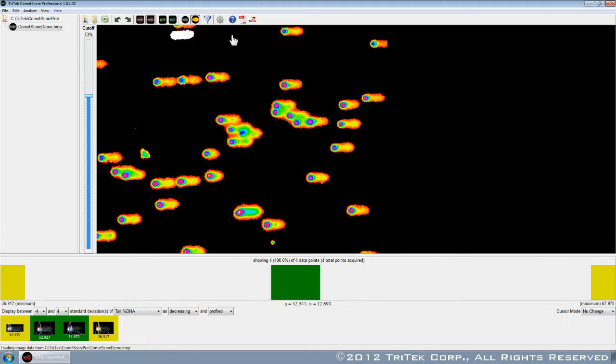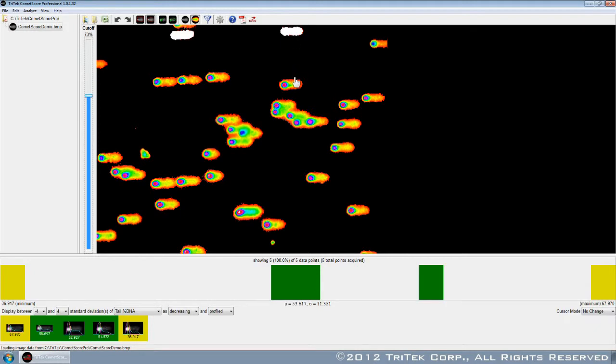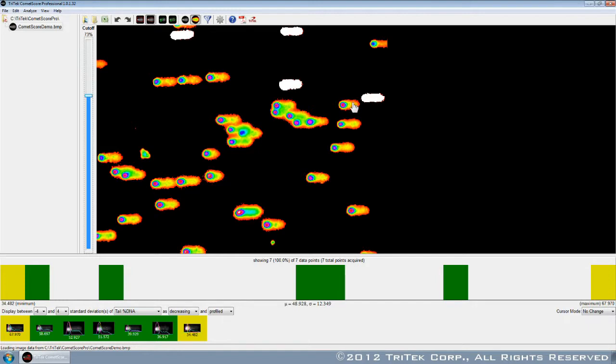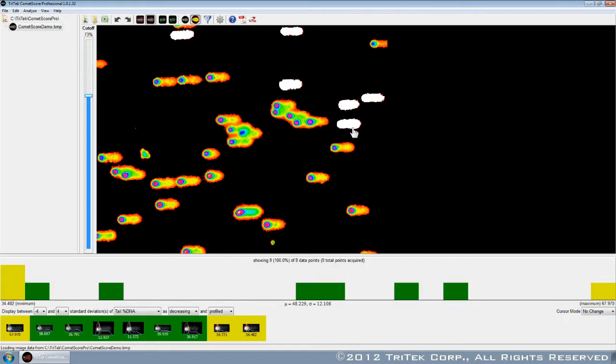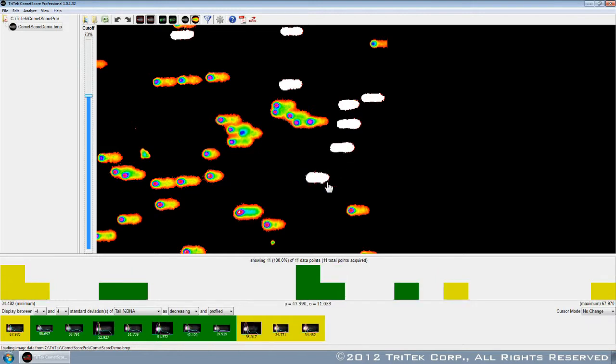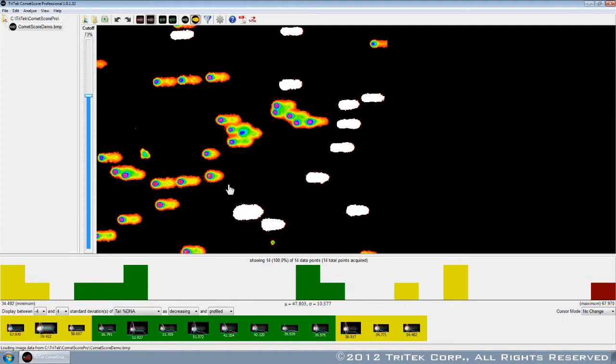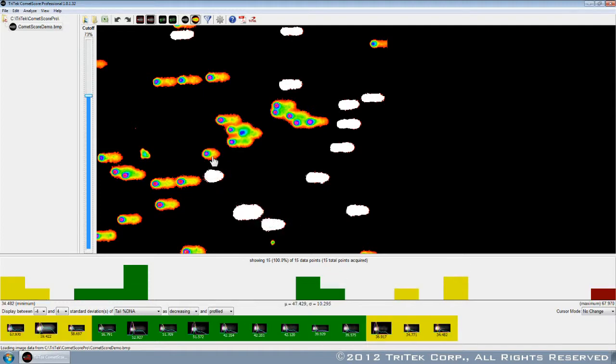For a more streamlined procedure, select CometScore Pro's one-click scoring technique. The program extracts each comet from the field of view with a single click, then automatically determines its head center and scores the comet.